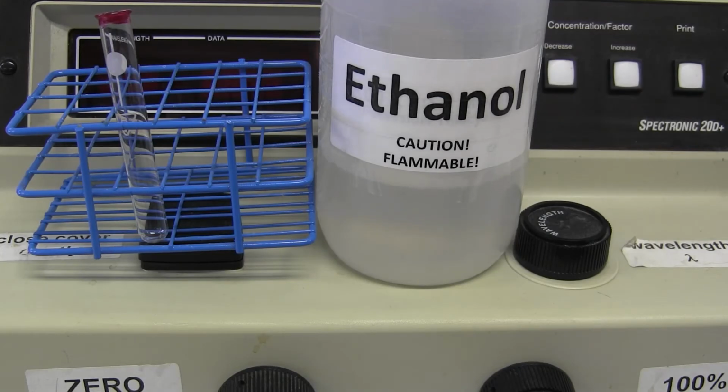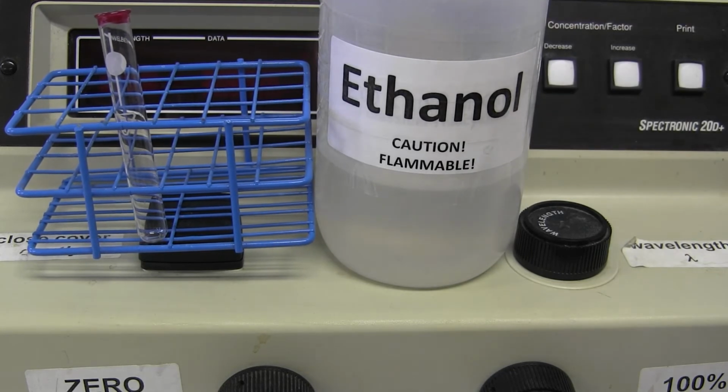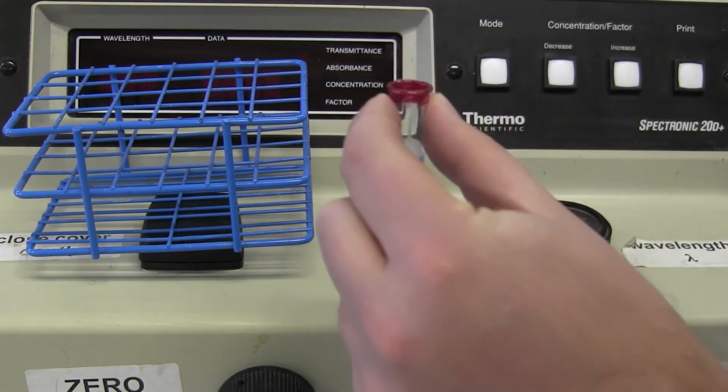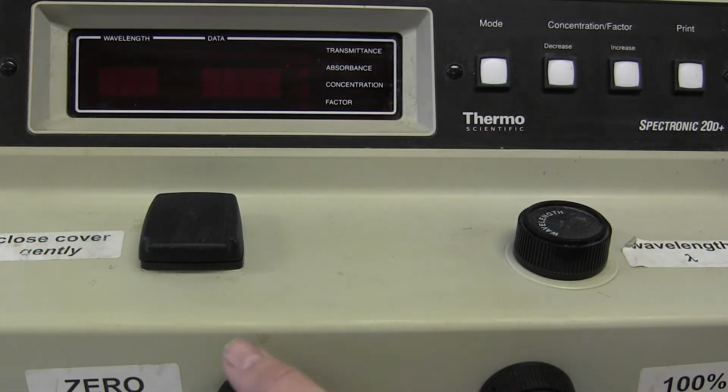To obtain the absorbance of the 3 solutions at 2 different wavelengths, you will be using the spectrophotometer. Remember, these solutions were prepared in ethanol, so when calibrating the instrument, instead of using water, you should be using ethanol in the reference set. To begin, you will be turning on the instrument. Remember, this needs to be calibrated for each wavelength.